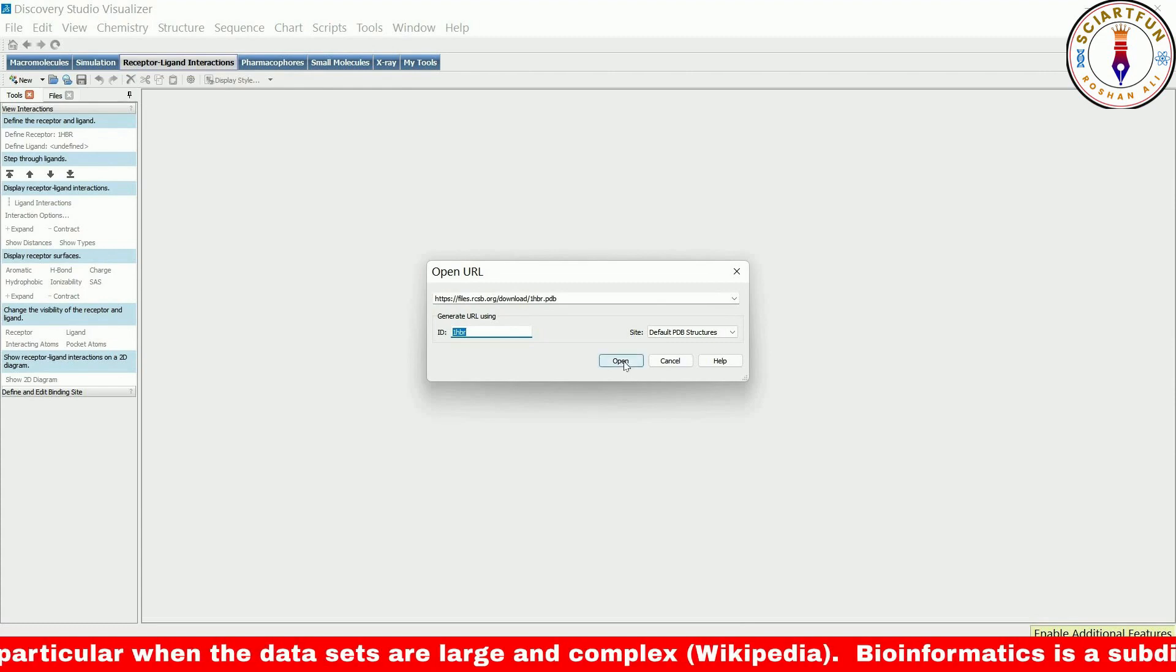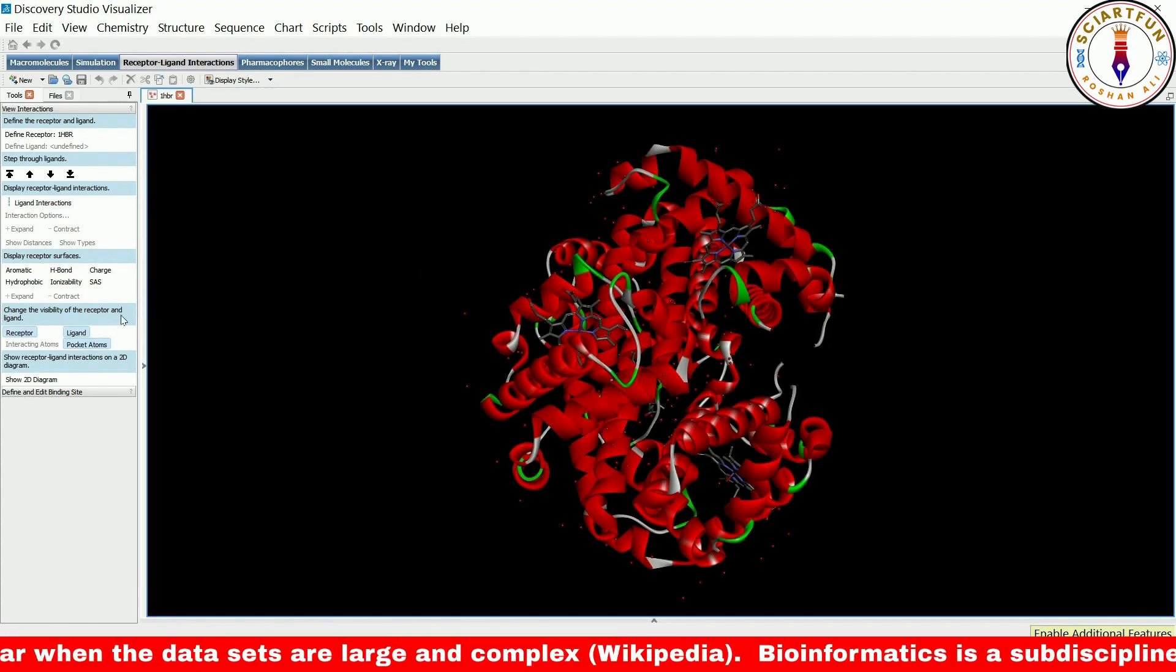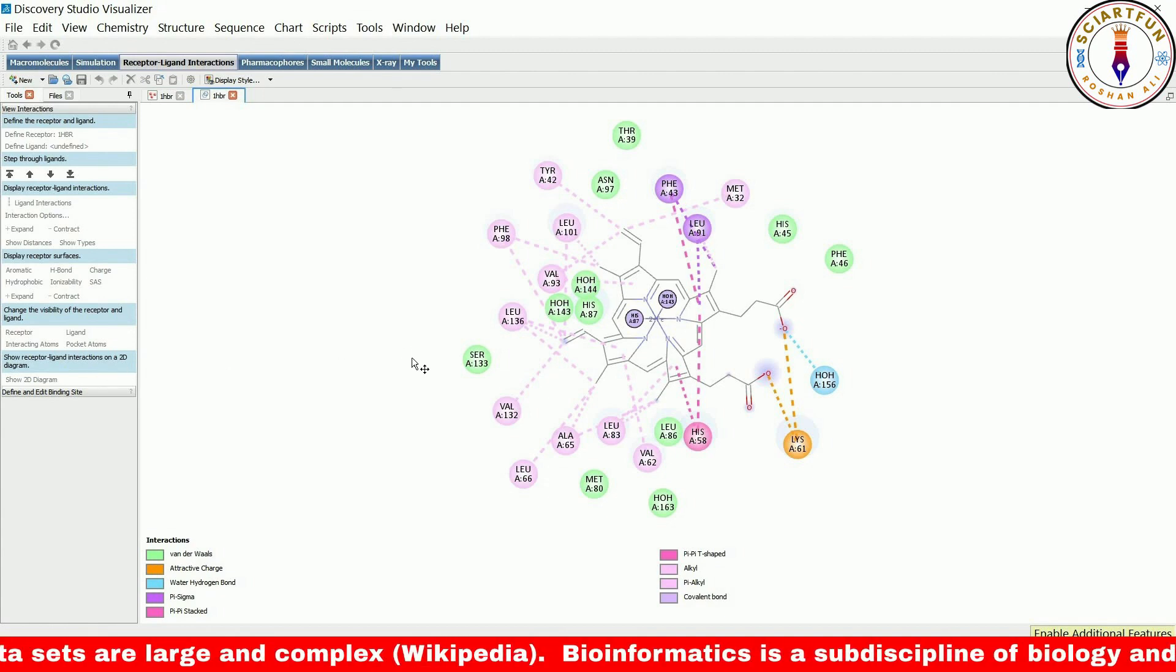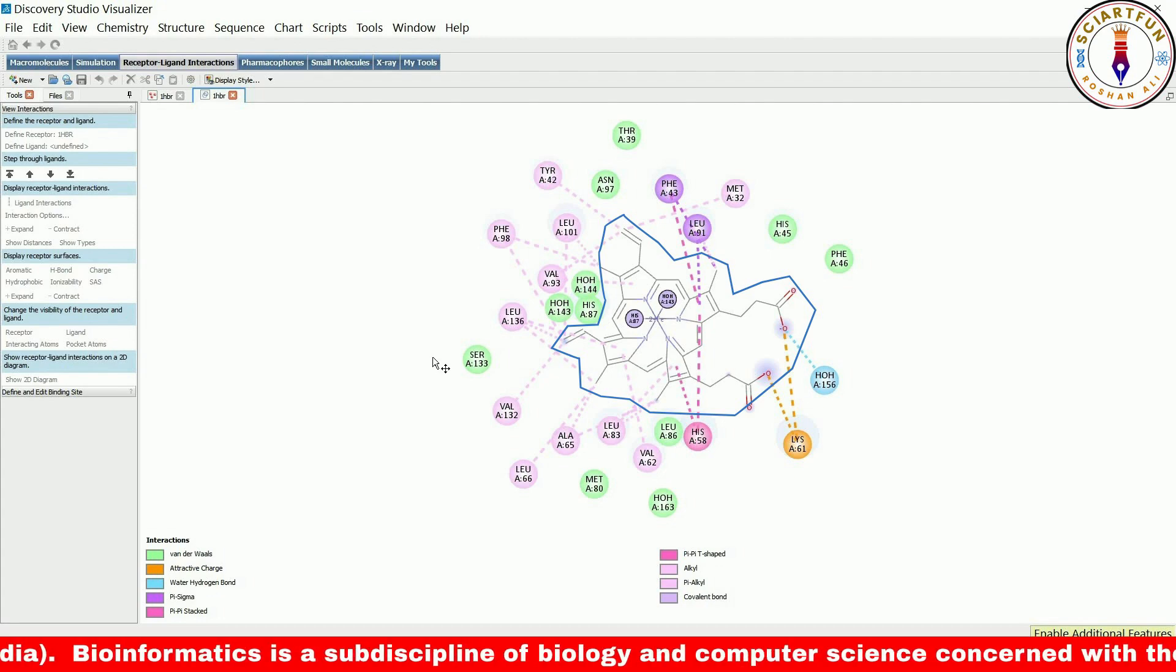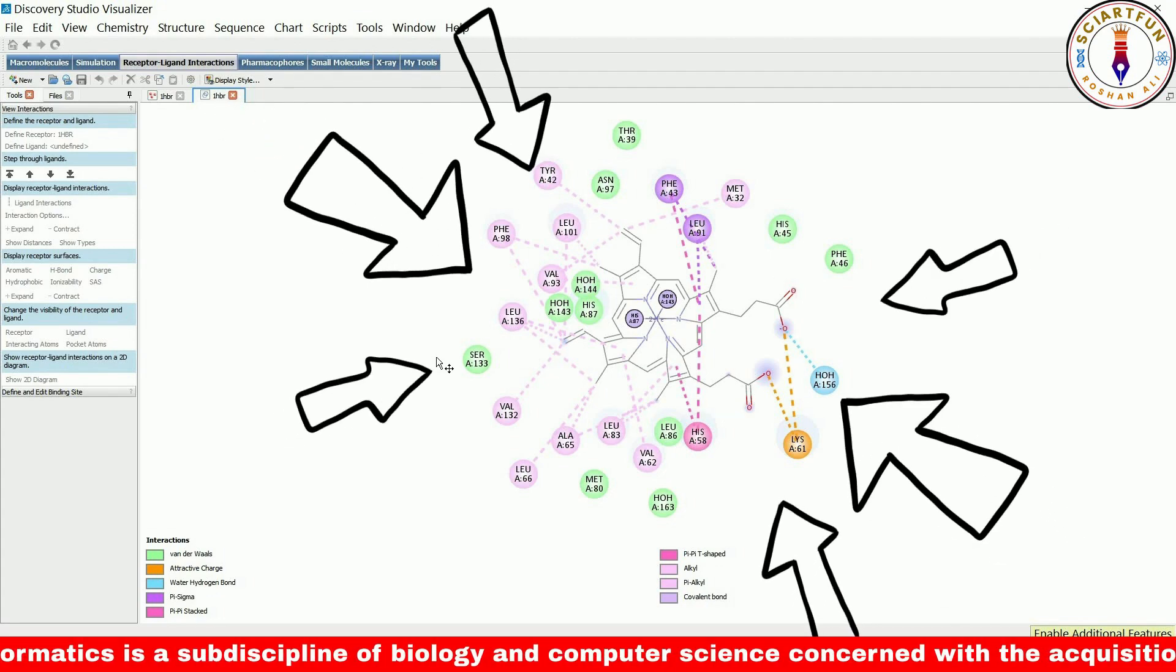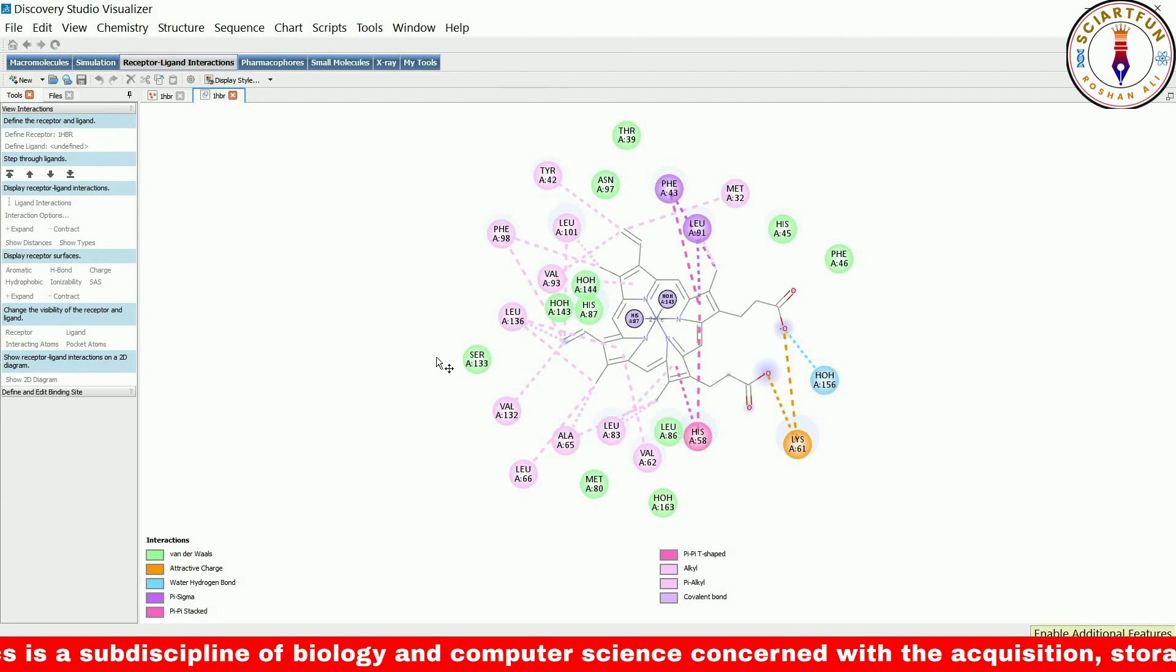First, we will open a protein molecule and then click to open the 2D structure of the ligand present in the molecule. The 2D structure representation shows the residues of the protein that the ligand has made interactions with. The 2D diagram has two parts: the ligand in the center represented as lines and the surrounding small circles representing the amino acids that they are interacting with.